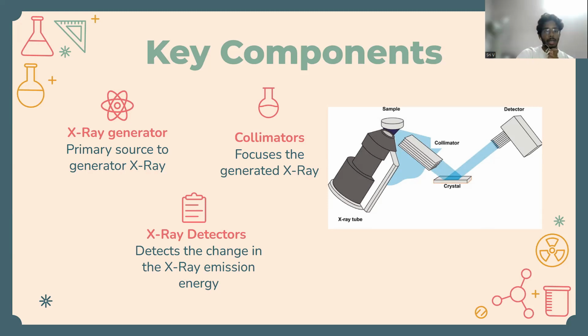The radiation emitted from a portable or handheld XRF elemental analyzer is similar to the exposure received in a normal medical or dental X-ray, so care must be taken to always point a handheld XRF analyzer directly at the sample and never at a person or a body part. There are a few safety tips we can remember to prevent accidents from happening when using the XRF spectrometer.